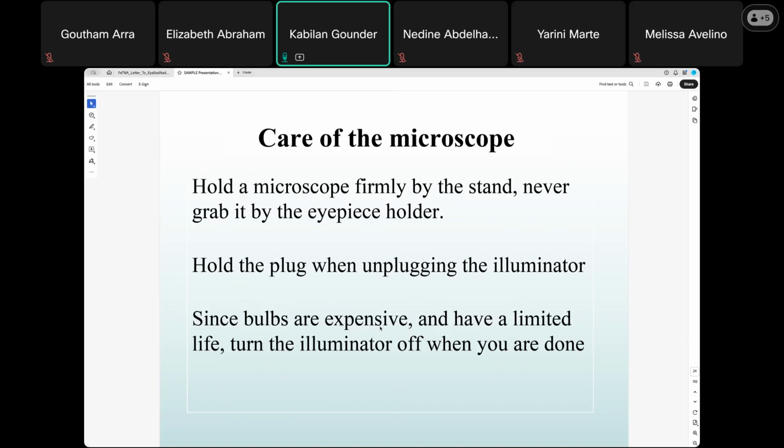The student microscope we use, you can easily carry from one place to another in the lab or lab to lab, because it is small and you can easily carry that instrument. Not like the bigger microscopes we have now with sophisticated digitalized systems. Those are not easy to move, but the student microscope you still can.